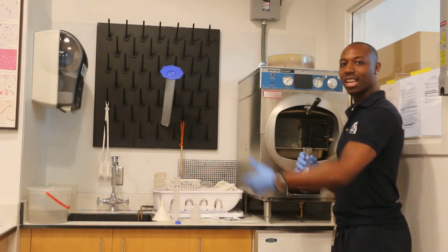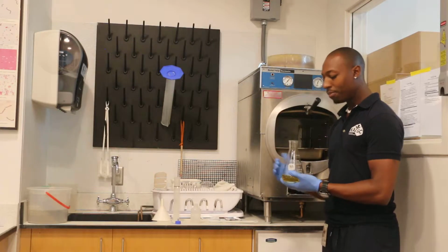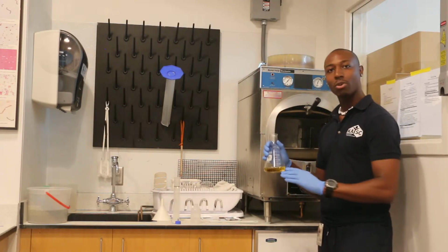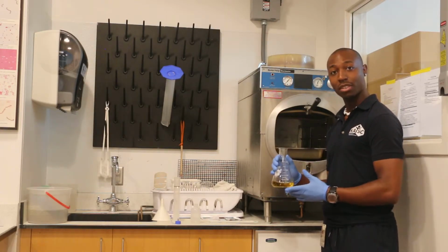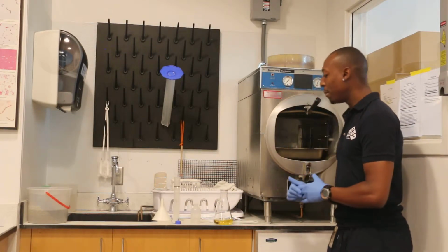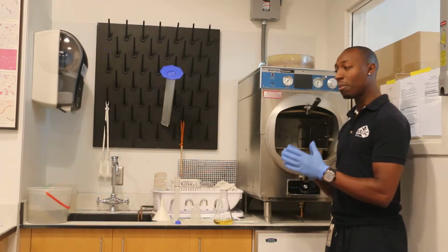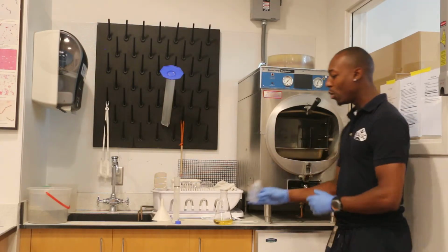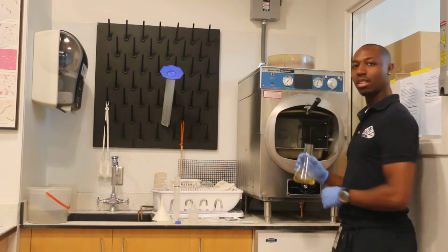Now, this is the other side to this trick, is because when you're actually making agar plates, the process is all the same. The powder, the bar, the magnetic plate, the flask, the liquid, it's all the same. The only difference is the agar liquid actually stays in the flask, okay? Now, I'm gonna actually do an experiment that shows you this process, but like I said, keep in mind what I just told you because everything is exactly the same thing. The only difference is that when you're making LB broth, you want to place the liquid in the bottle and the bottle itself in the autoclave. When you're making agar plates, you want to keep the agar in the flask and the flask into the autoclave, okay?